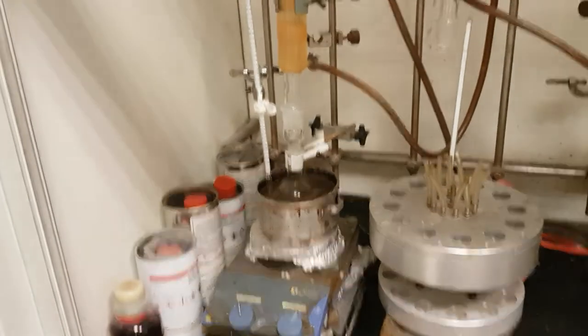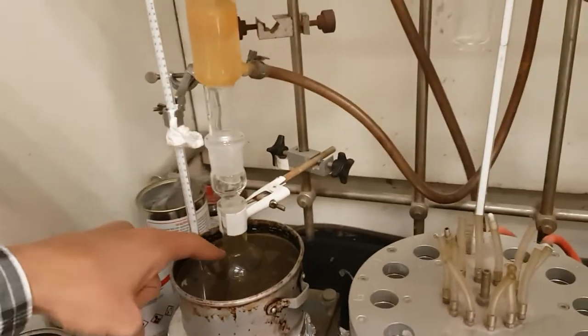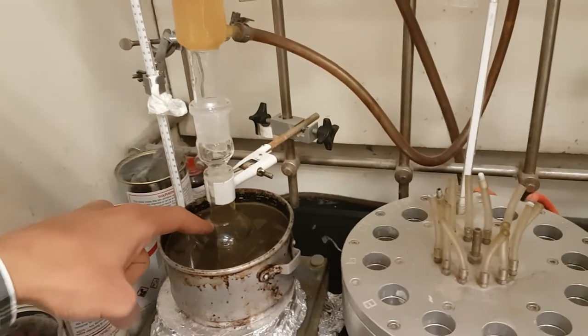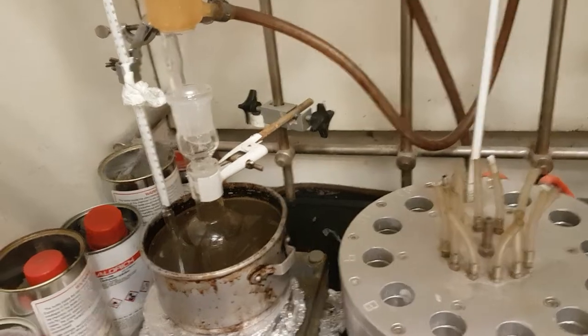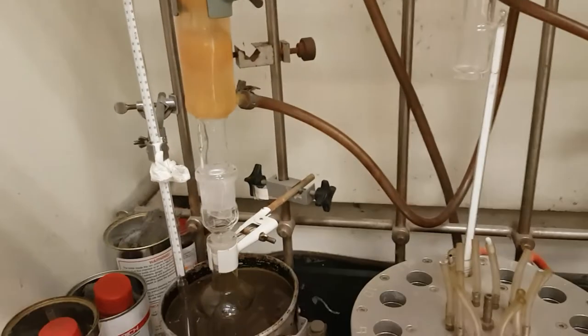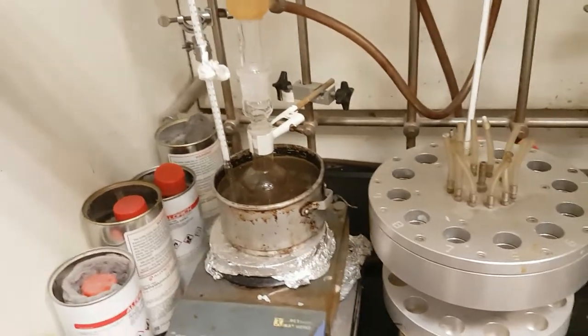Now we are heating under reflux. We put our flask here — we have the substrate, the reagent which is the benzylamine, the solvent, and the catalyst. This is the thermometer. We need only 70 degrees — usually we use 70 degrees to make the opening of an epoxide.